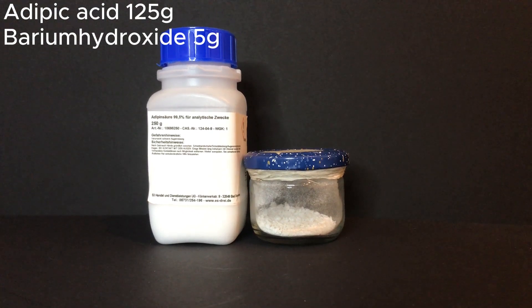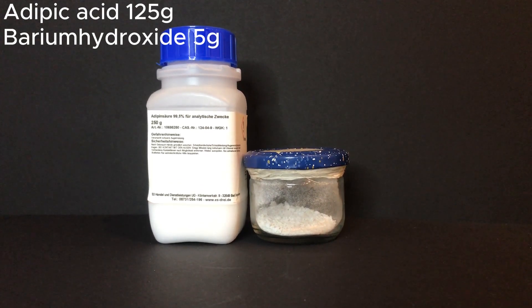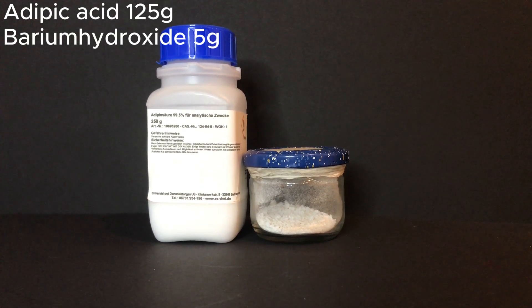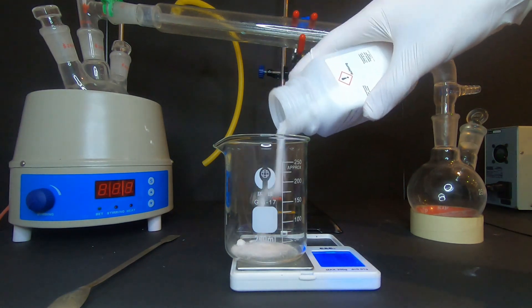Hello guys, I am Mr. Yellow and in this video we will be making some cyclopentanone for the cubane project. For this we need 125 grams of adipic acid and 5 grams of barium hydroxide. I hope you enjoy the video.